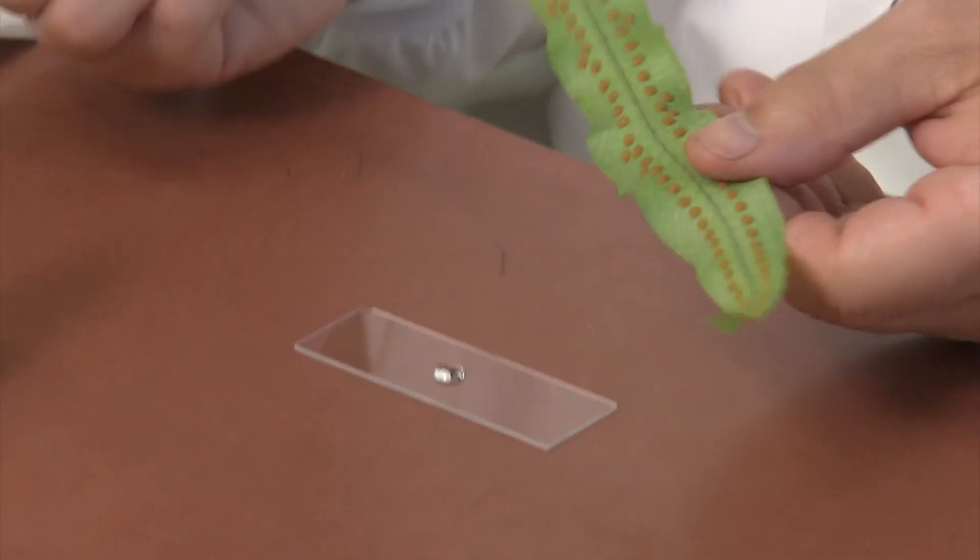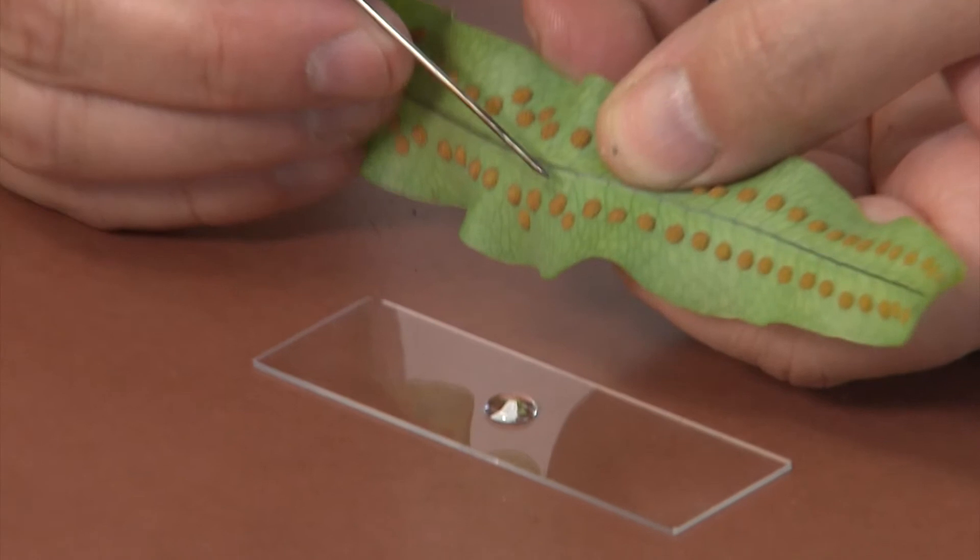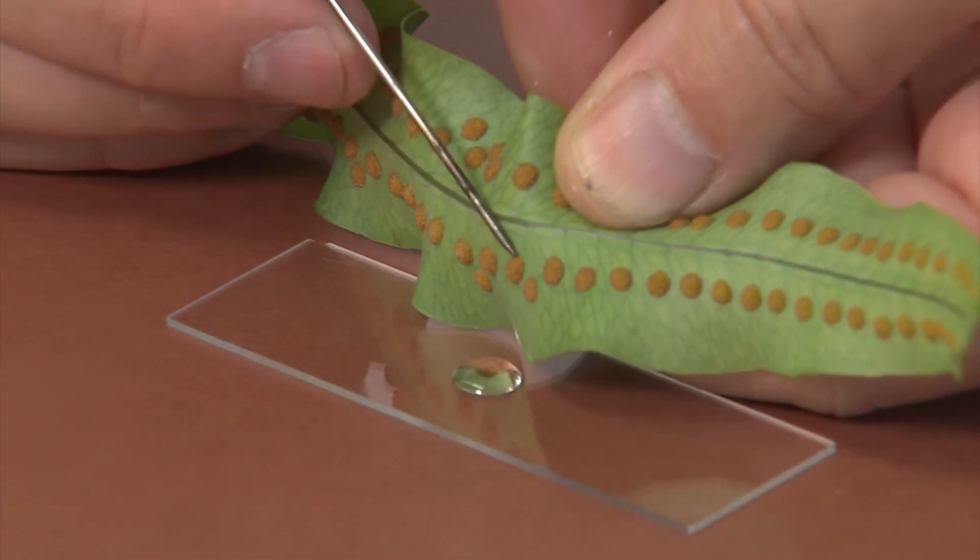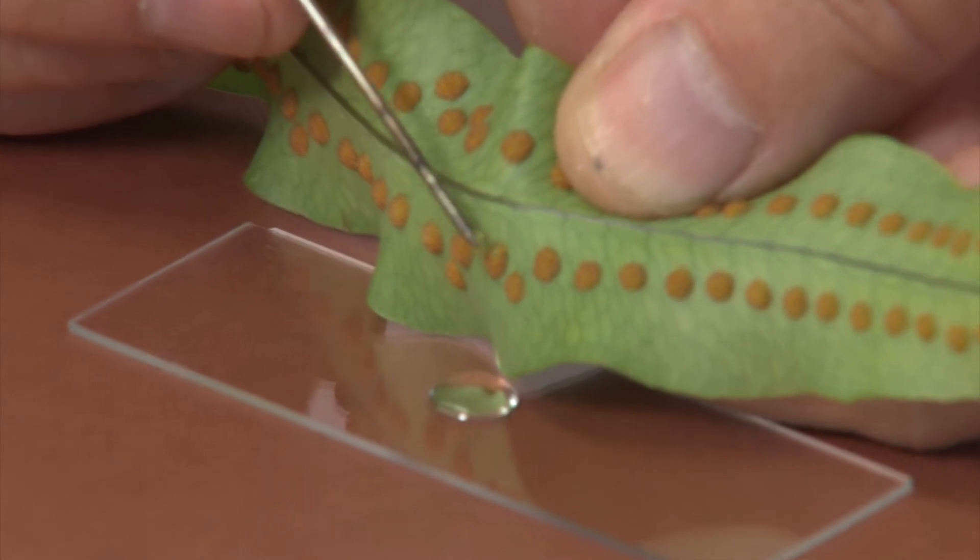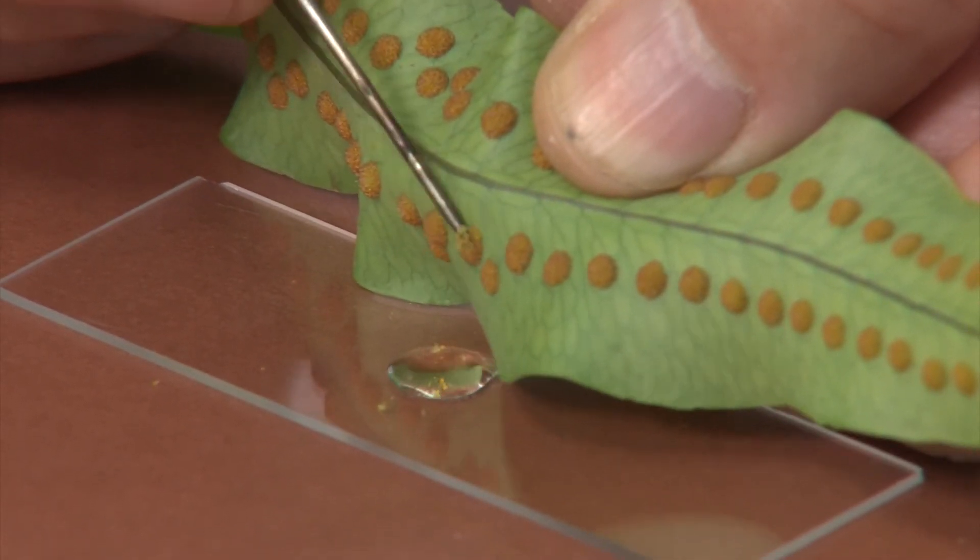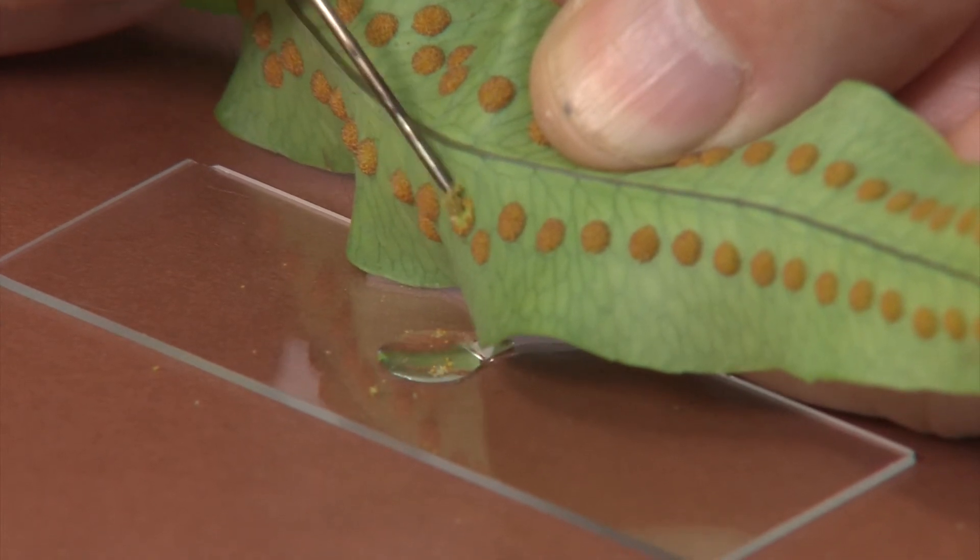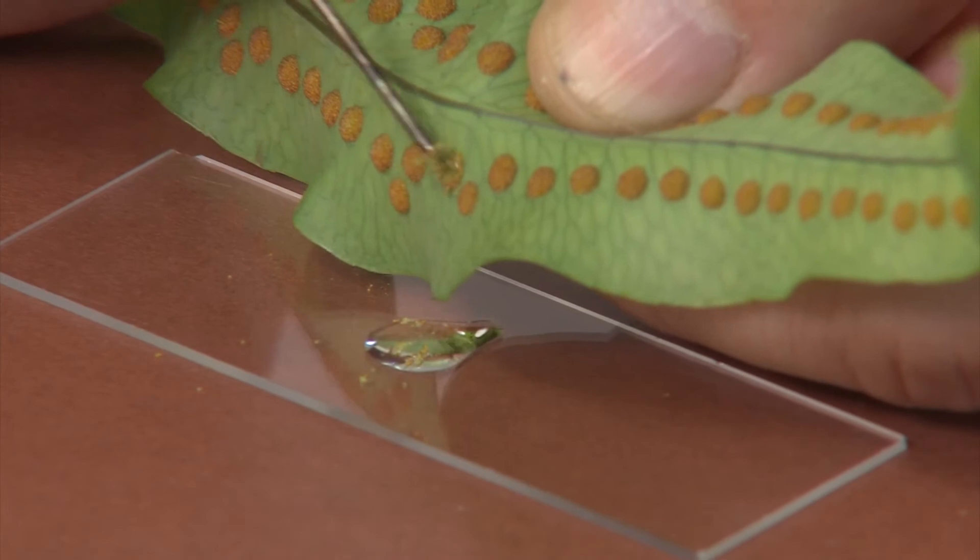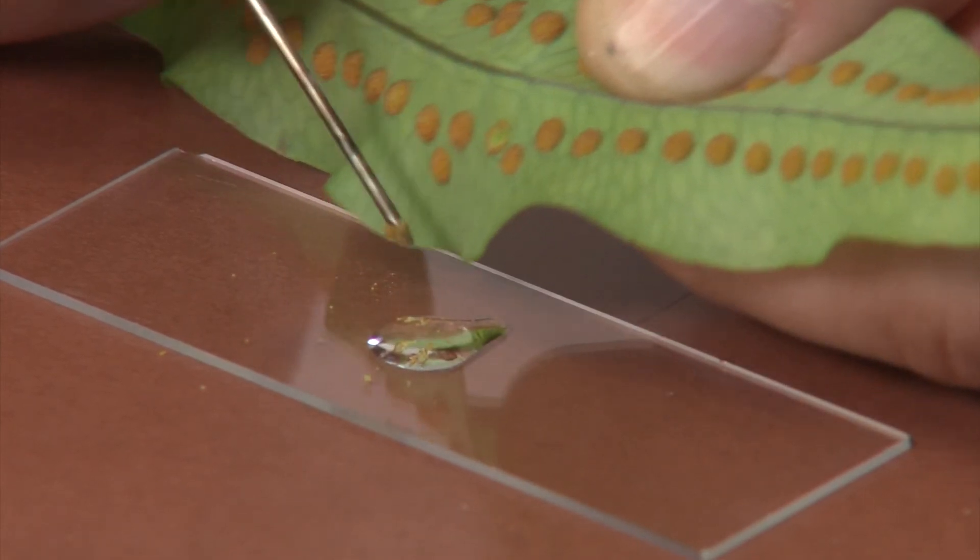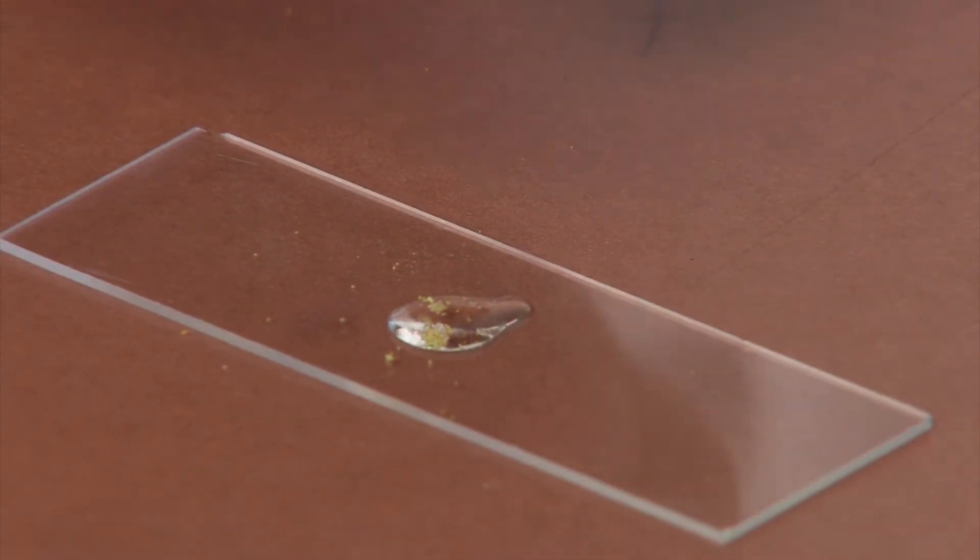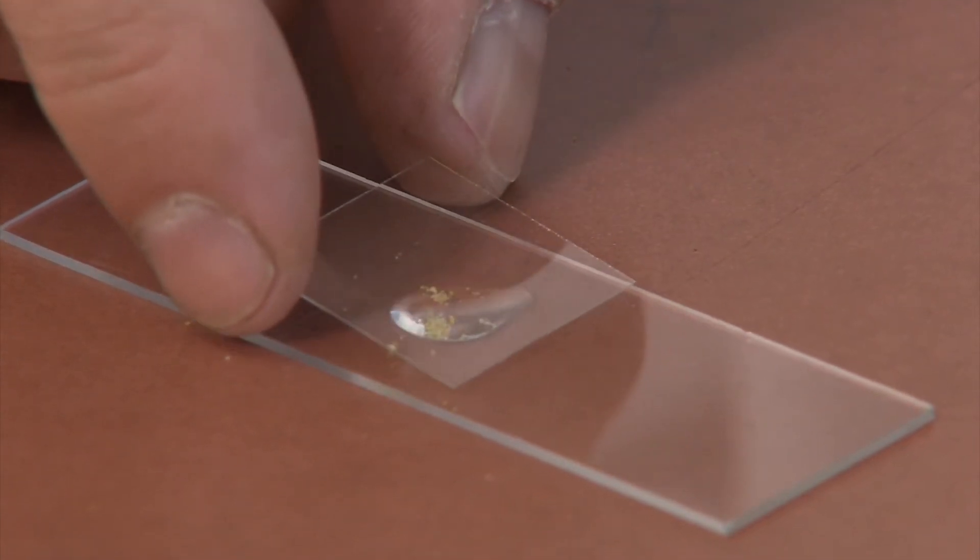Use the dissecting needle to scrape at a sorus so that the sporangia fall into the drop. Carefully apply a cover slip.